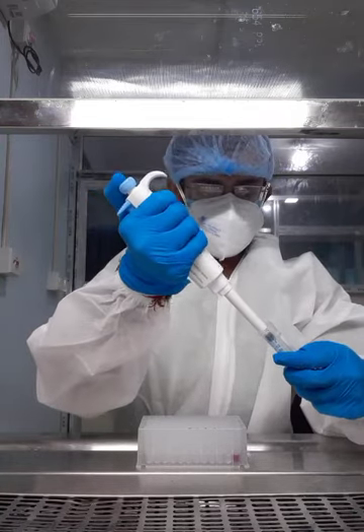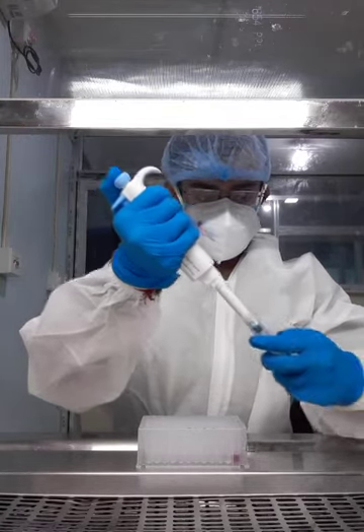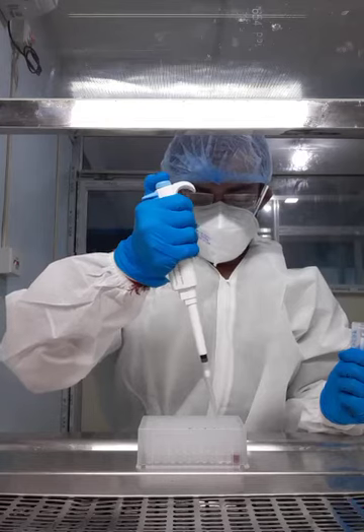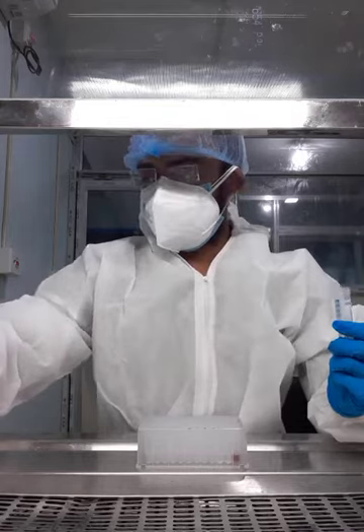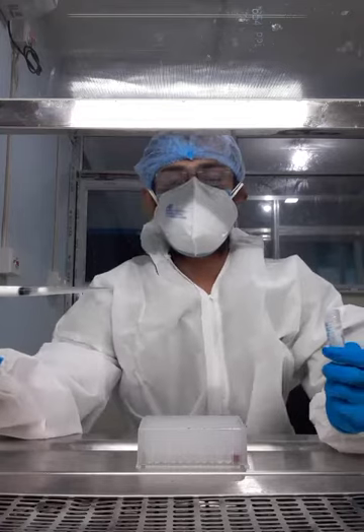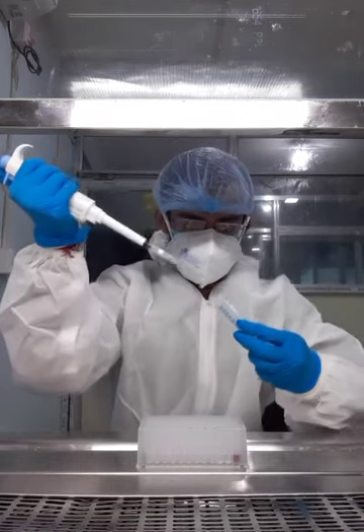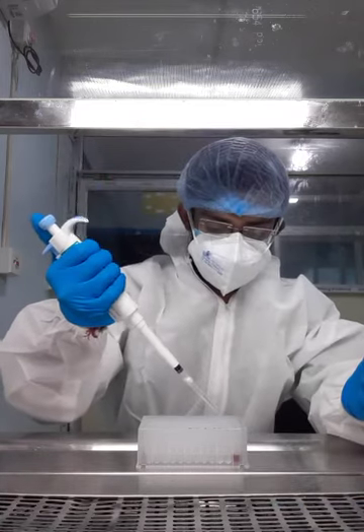Again, take 500 microliter for patient A in column 3, then dispose it. For patient B, I told you before that you have to take 500 and 500 microliter, 1 ml for each patient. So I already added 1 ml for patient A. For patient B, I have to take another 500 microliter and put it in the second column.